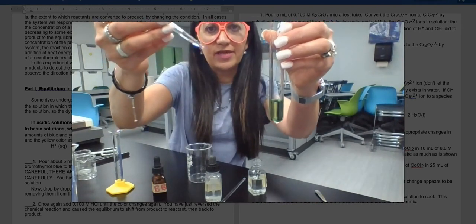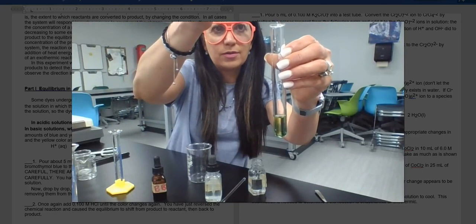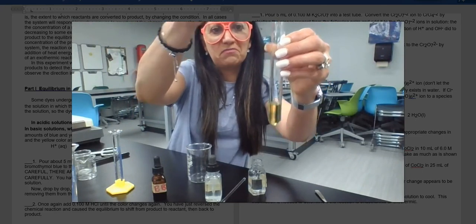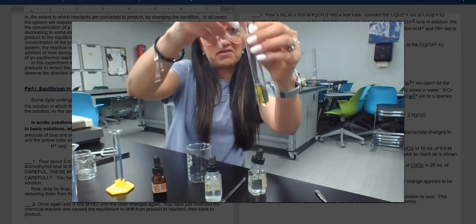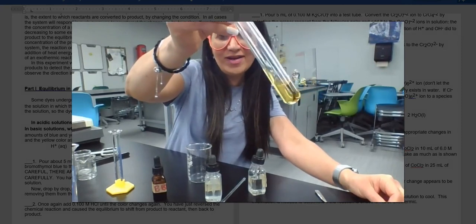So you can see it's kind of like this green color right now. 1, 2, 3, oh, I missed one. 4, 5. Maybe 6, but it's okay. Okay. Oh, what? Turned yellow.